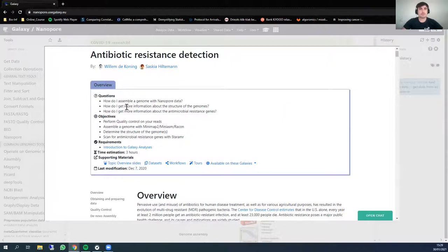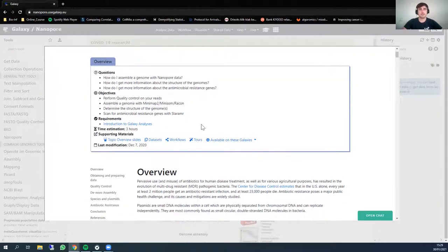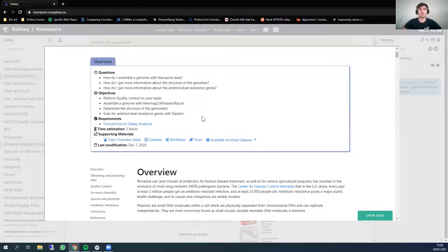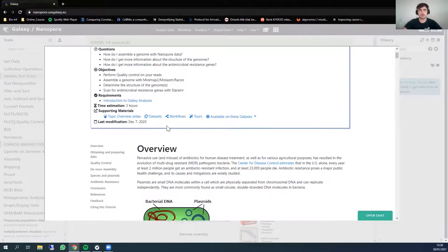There are some questions we are going to try to answer: How do I assemble a genome with nanopore data? How do I get more information about the structure of genomes? How do I get more information about the antimicrobial resistance genes? To answer these, we will perform quality control on the reads, assemble a genome with Minimap, Miniasm, and Racon, determine the structure of the genome, and scan for antimicrobial resistance genes with StarAMR. Those are the main objectives, with some small extra steps throughout the tutorial.